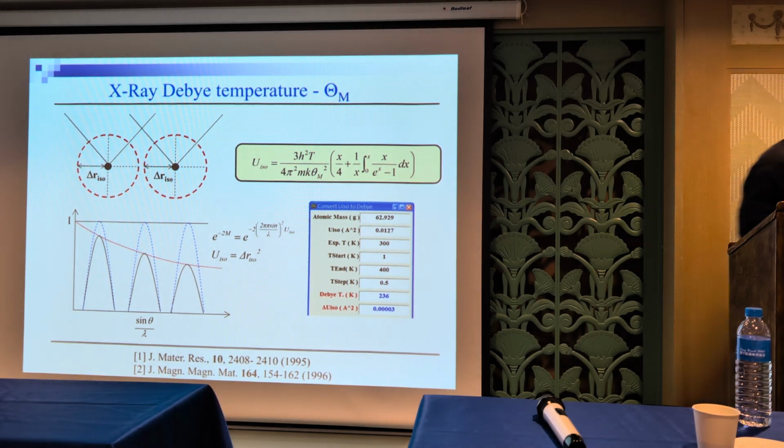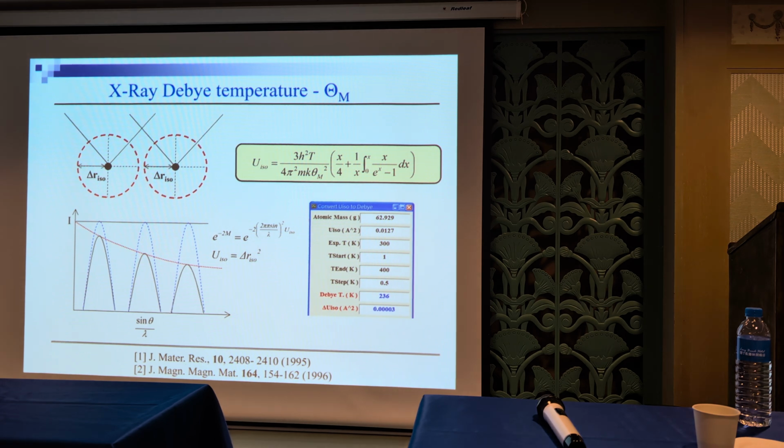This effect also matters when you set up the experiments. If you spread your powder sample or your bulk sample larger than the beam spot, it will also give you an intensity decrease with the scanning angle. So that would be very important. And this is a key issue: if you want to get the correct Debye-Waller factor or thermal factor, you need to put your sample in the correct position and size.